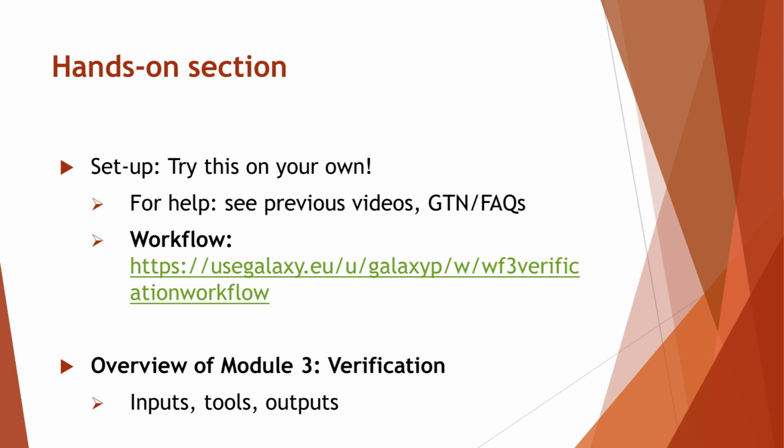Here, I encourage you to pause this video and try setting up on your own, including creating a new history and importing the data and workflow. Be sure to put the sample data sets into a collection to keep files organized. If you need help, please see the previous videos in the GTN tutorial and FAQs. Following setup and starting the workflow, I will discuss the workflow more in depth.